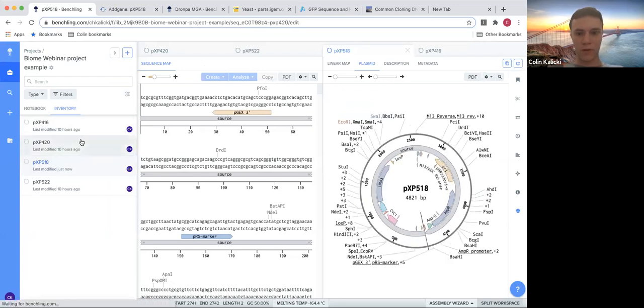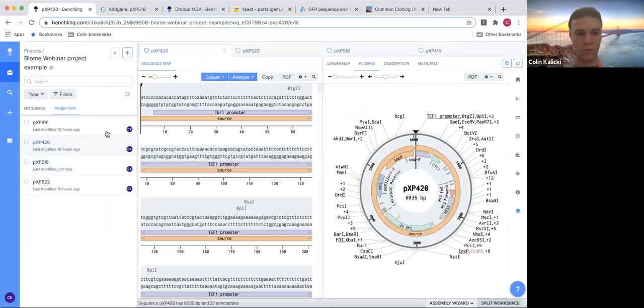So I found some other ones I wanted to mess with. I thought this one was pretty good, but I looked at it more closely. And as you're pointing out, Ethan, I looked for restriction sites. There aren't really good ones. So what are restriction sites? This is a good question for the chat. What are restriction sites used for? Why is that important?